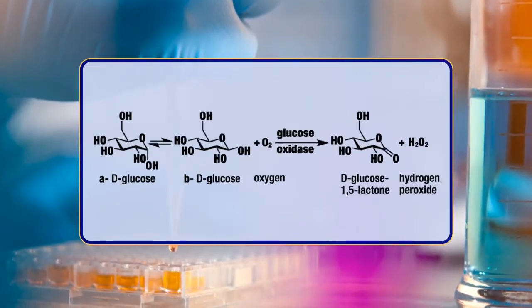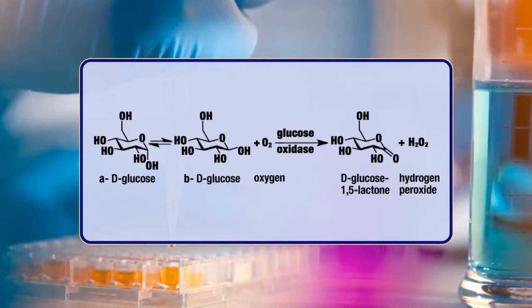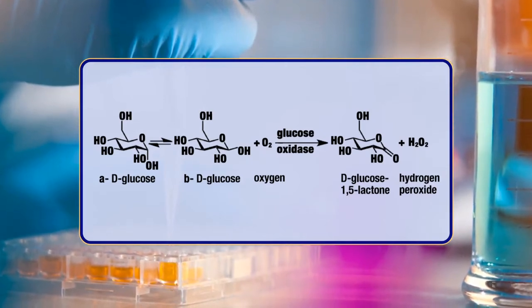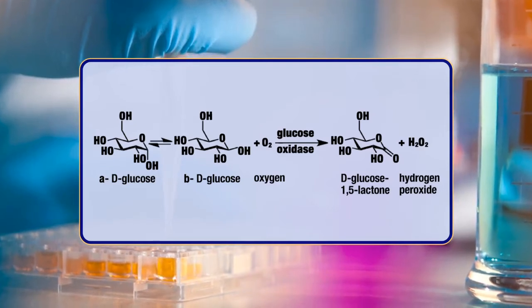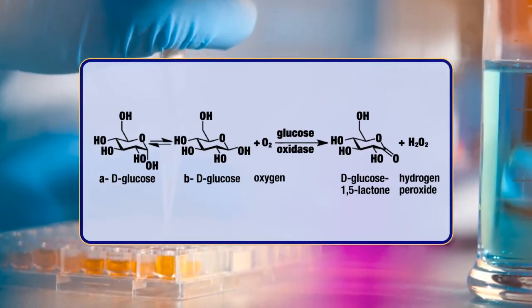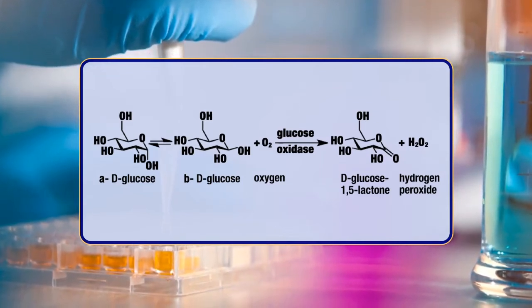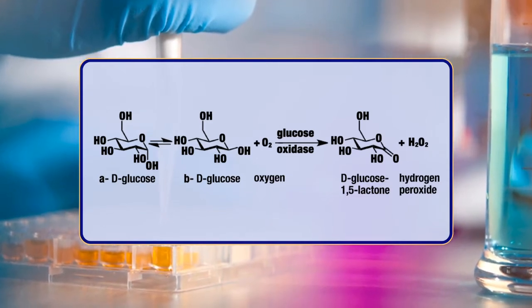In this experiment, our aim is to calculate the enzyme kinetics parameters such as Km and Vmax of an enzyme, glucose oxidase, using glucose as substrate. In the reaction catalyzed by GOX, one molecule of glucose is converted into one each of hydrogen peroxide and D-gluconolactone.